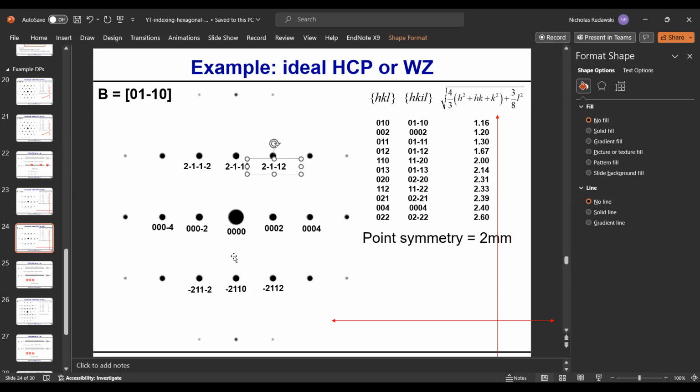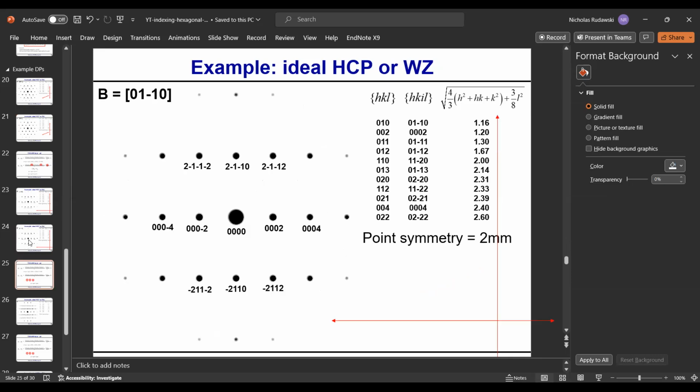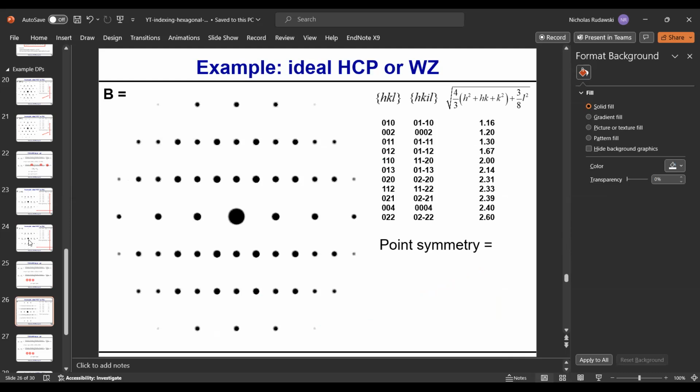All right, so those of you familiar with the hexagonal lattice, you'll recognize this. This is what's called M-plane. So planes or directions that are of this form here, the 0, 1, 1 bar 0 family. In the case of what we did before, this would be C-plane, because we have 00001 here. Okay, so moving along, we'll move on to the next one here.